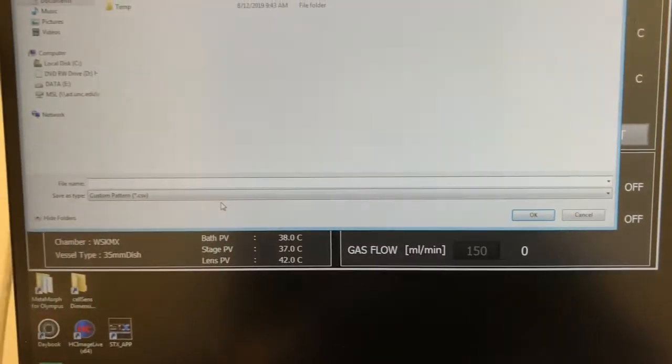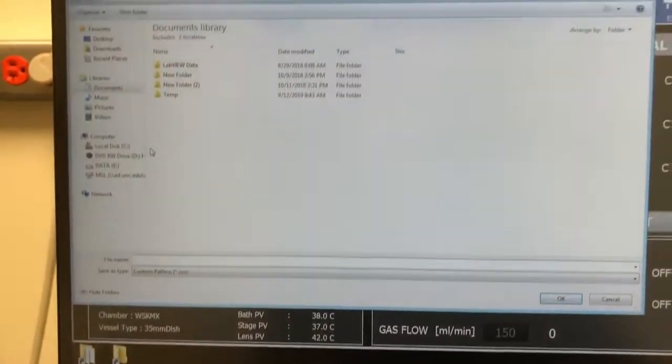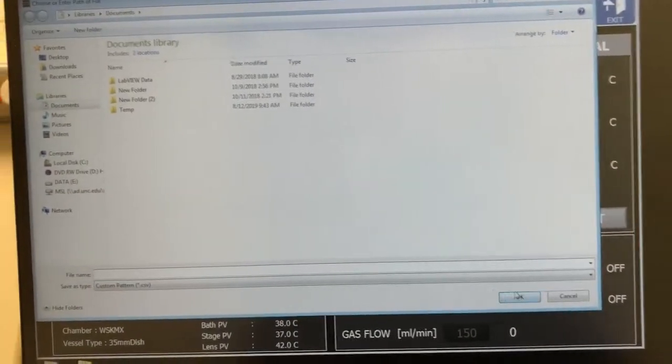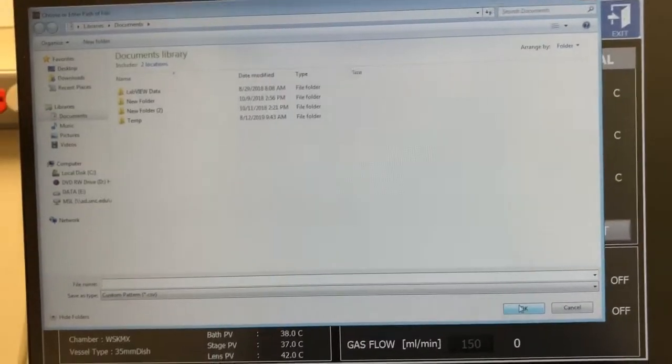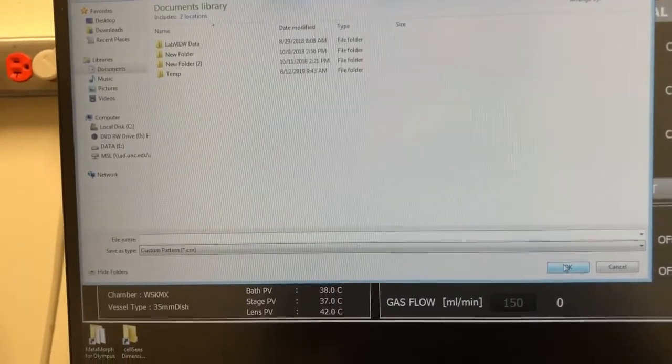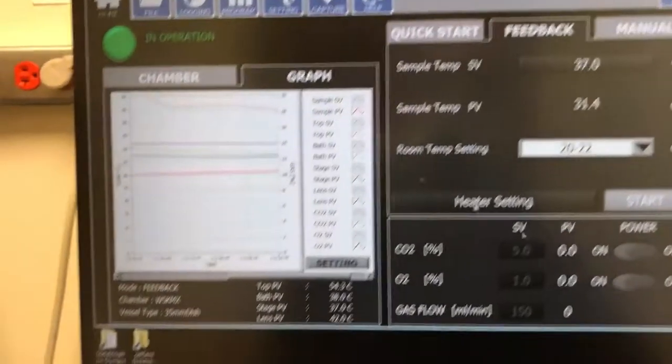And then save this. And it will save it as a CSV wherever you want. Now, the key thing when doing these experiments where you want to measure the temperature.